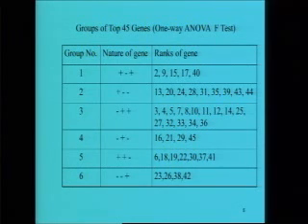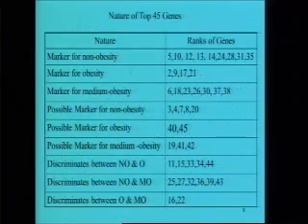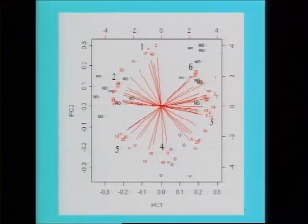There are a variety of multivariate analysis techniques. So I'll just tell you one technique. Okay, we'll come to this later. So this is a multivariate display of the top 45 genes. This is known as a biplot. The underlying mathematics for this is singular value decomposition, a very important tool from linear algebra. What it does is this entire data matrix of dimension 22,283 by 24 is reduced to a rank 2 matrix.